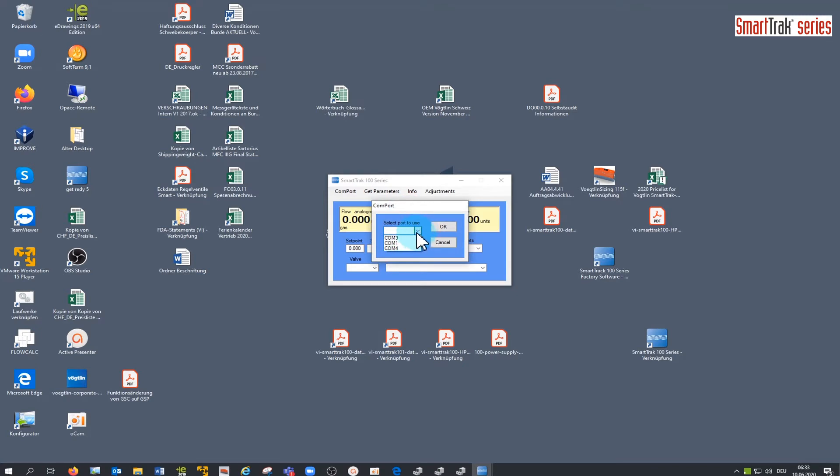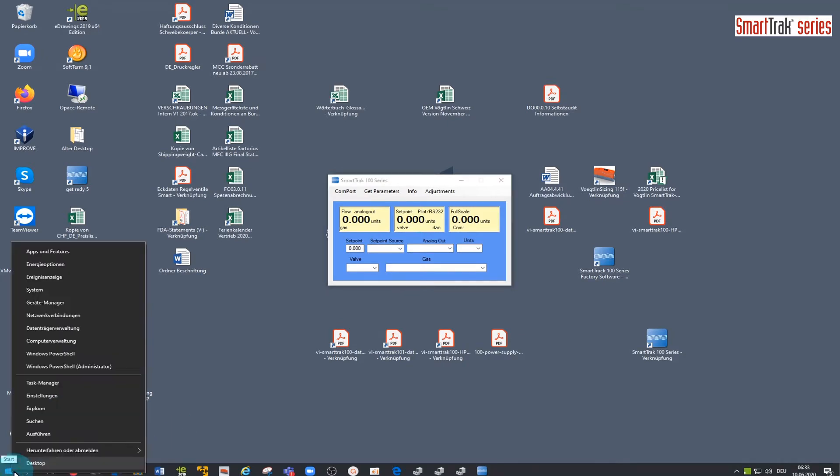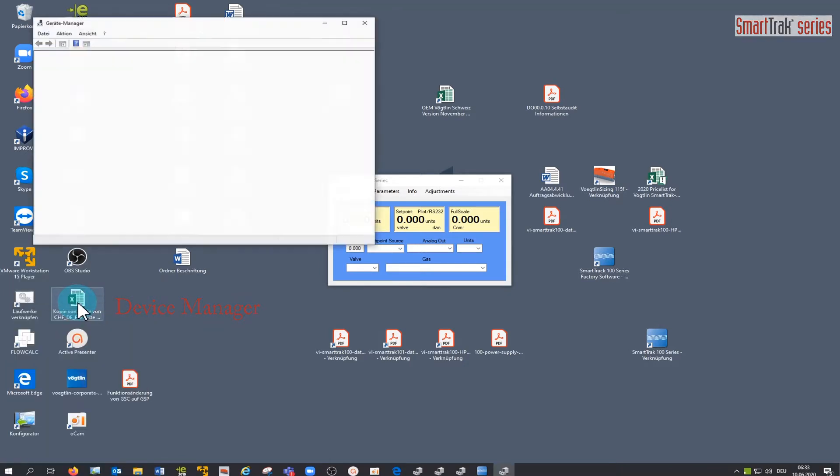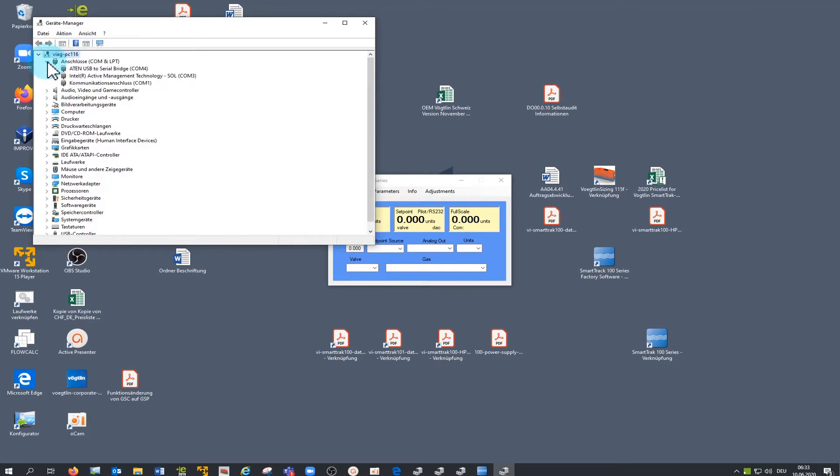If you do not know to which port your device is connected, then open the device manager by clicking the right mouse button on the Windows logo. Check the port to see on which port your RS232 to USB converter cable is plugged in.